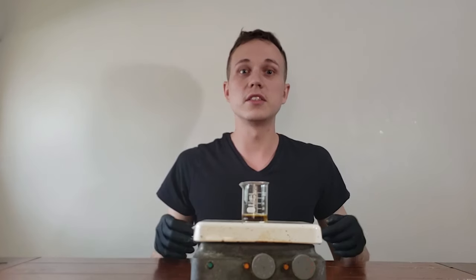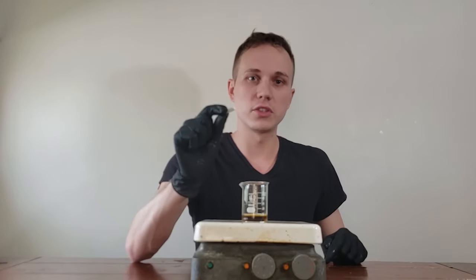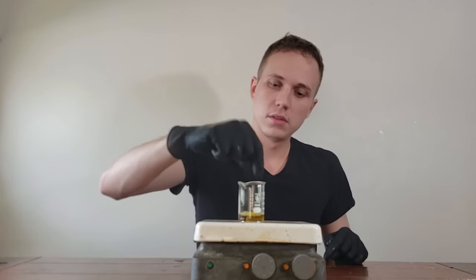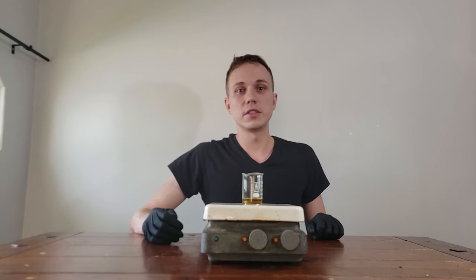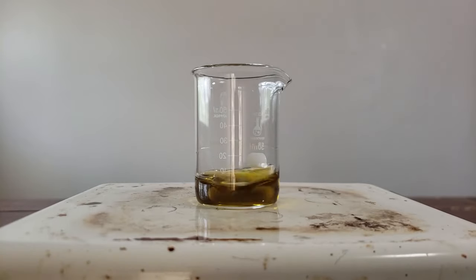My hot plate has a built-in magnetic stirrer. It's a magnet that spins around and spins a magnetic stir bar. This automates the stirring process and speeds up the overall evaporation. It may take some time for all of the alcohol to evaporate. Keep checking back on it every so often so that you don't burn your rosin.